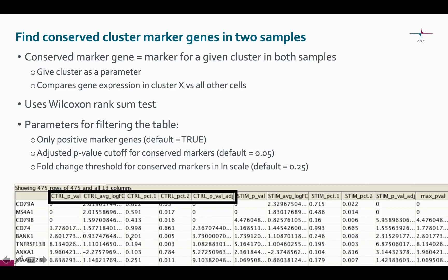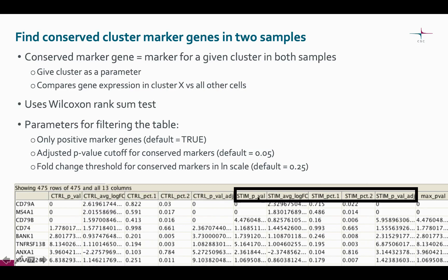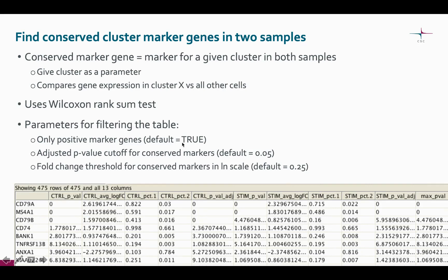The value labeled two means the percentage in all the other cells. All these values are computed for both samples, and parameters for the tool are looking at both of the resulting values. You can filter this table based on these three parameters. By default, only the positive marker genes are reported — that is, genes that are more highly expressed in the cluster in question compared to the other cells.